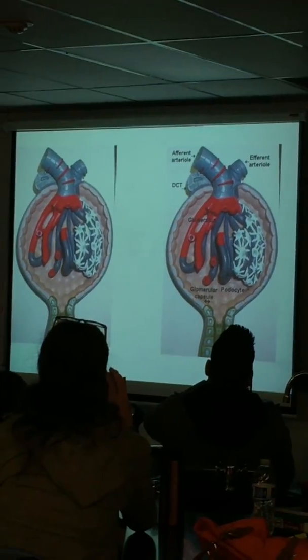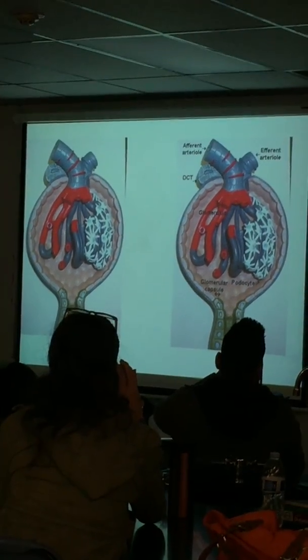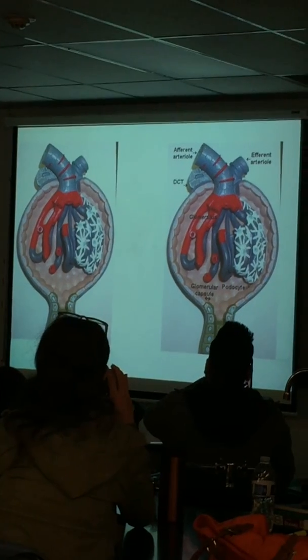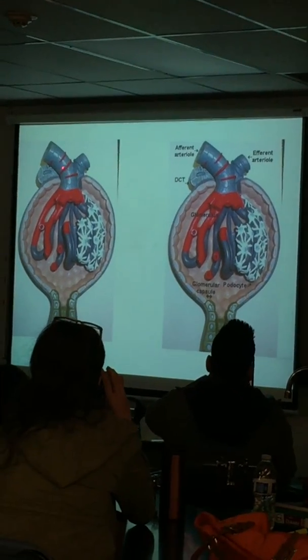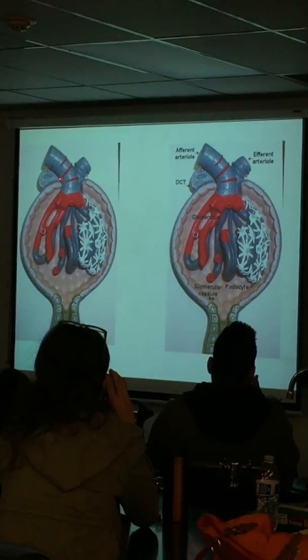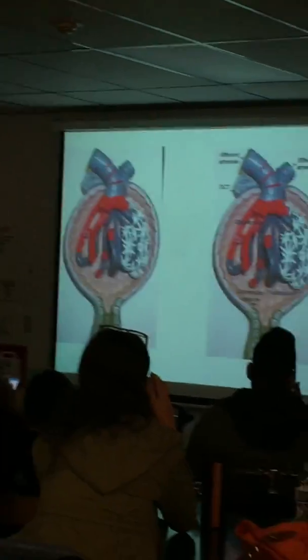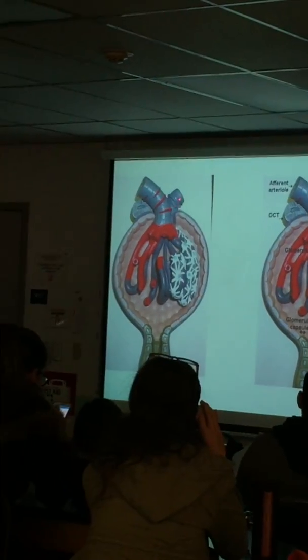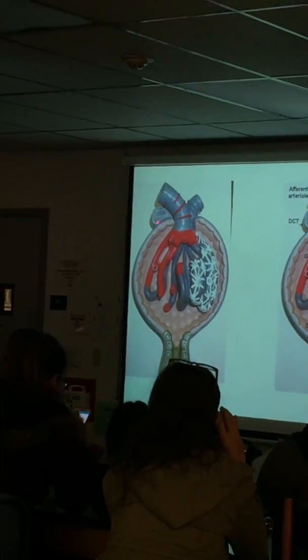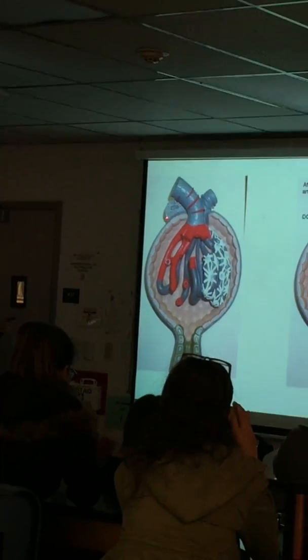More renal corpuscle stuff. So the specialized cells are not the slender spindle-shaped cells. Those are normal smooth muscle cells. It's these hexagonal ones, which are the specialized ones, the juxtaglomerular cells. That's the afferent arteriole, efferent. This is the DCT, but specifically, I'm going for macula densa. That's what it is at this location.